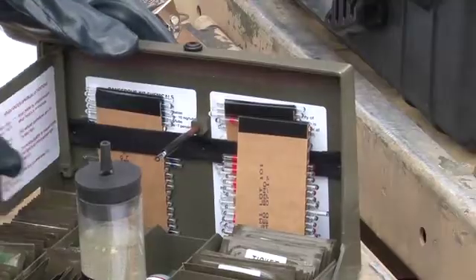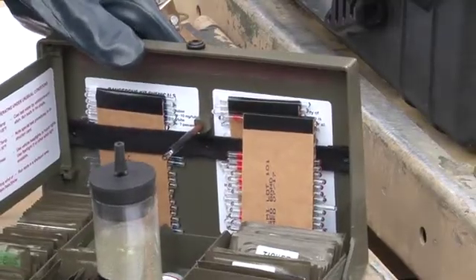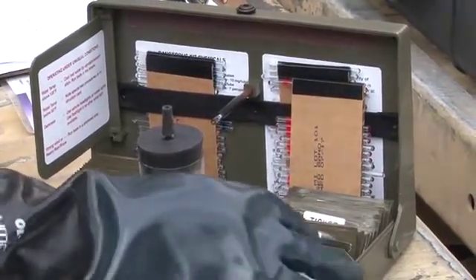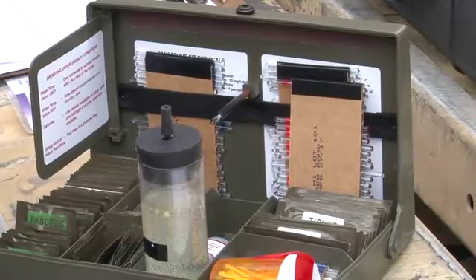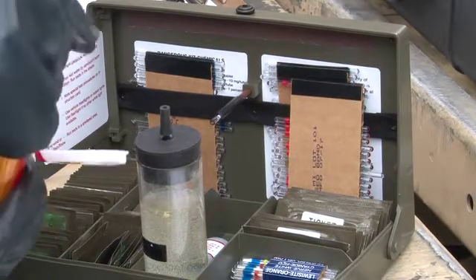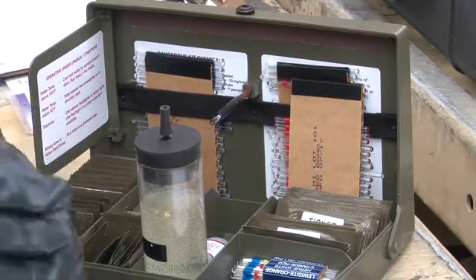Plug your heater into the socket inside the case top and then swing out your windshield. You will also turn the back of the case into the wind. If you are in a very windy situation, use your body as a shield from the wind as well. When you are situated, remove a match from the container and close the container.